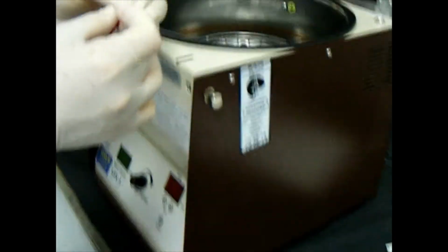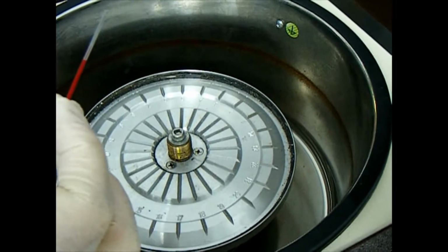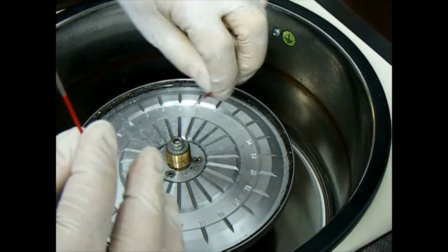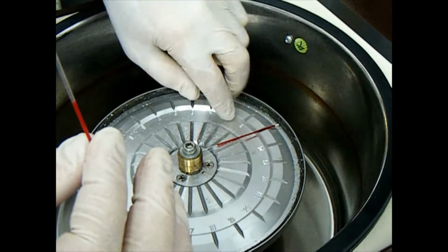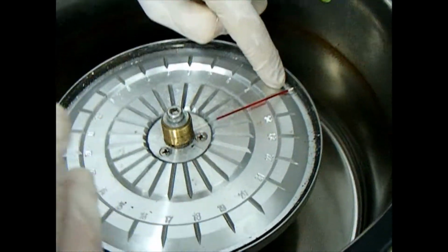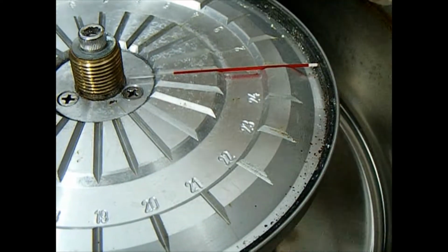So when you come to the centrifuge, you can see this is the rotor that spins around. The centrifuge is switched off at this stage. When you put the tubes in, you make sure that the plug is on the outside, so the blood then is going to spin down and not go out the tube.